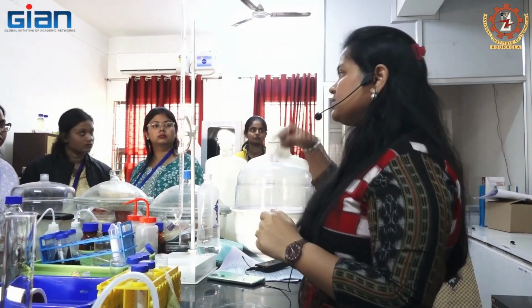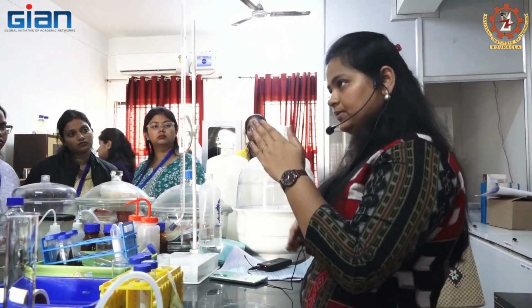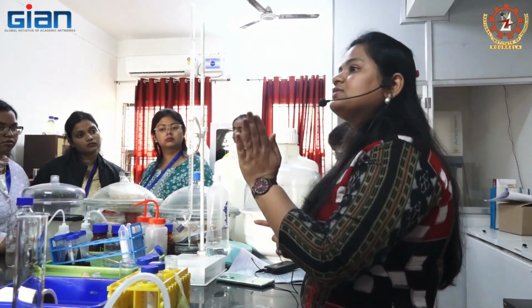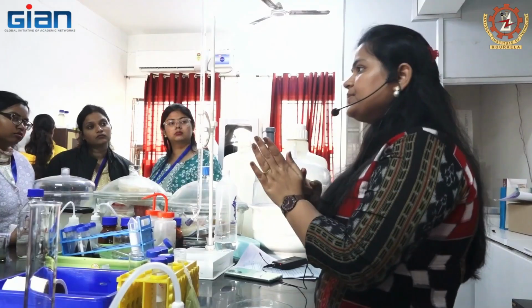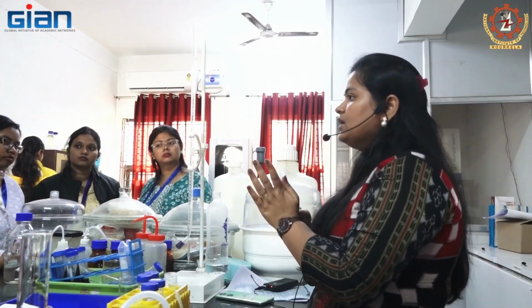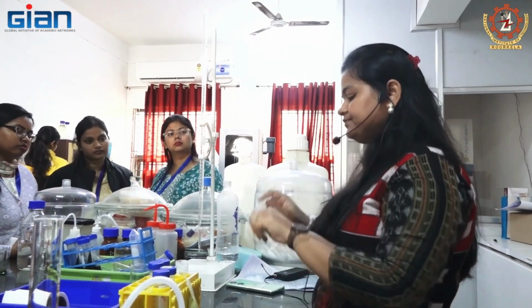When we continuously apply the microwave, the polar compounds like hydrogen and oxygen keep getting charged like this, and they oscillate very fast and create heat. It creates a very high temperature, and this high temperature is responsible for the disruption of the cell walls.